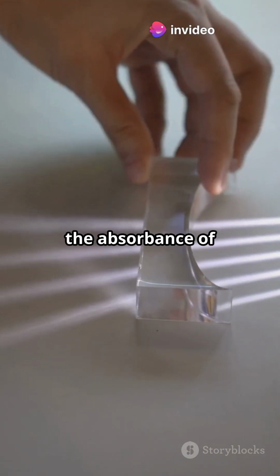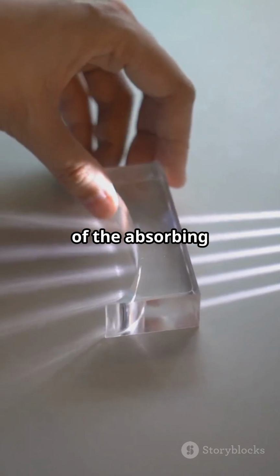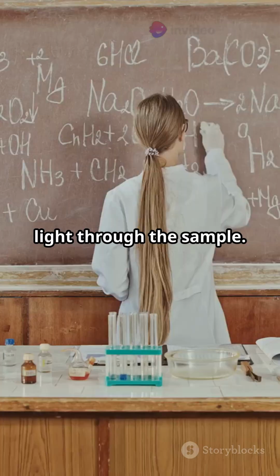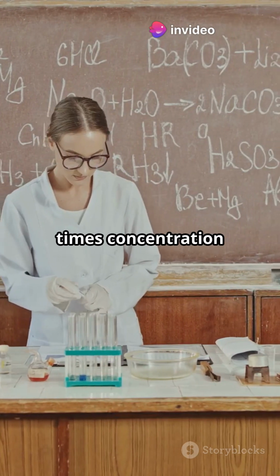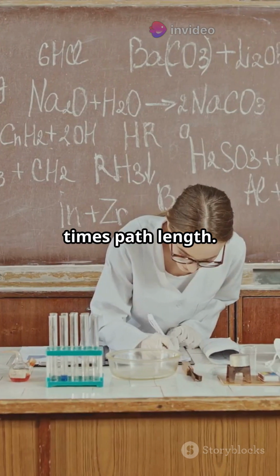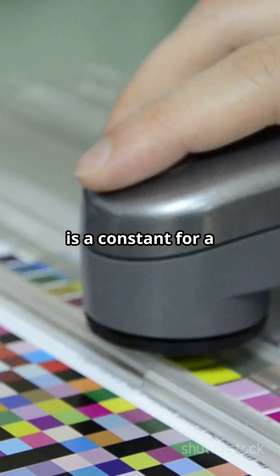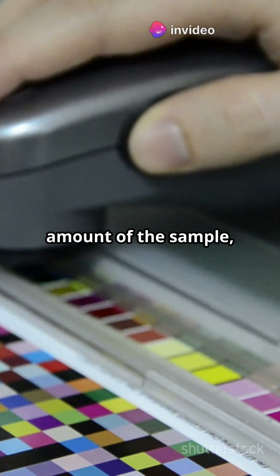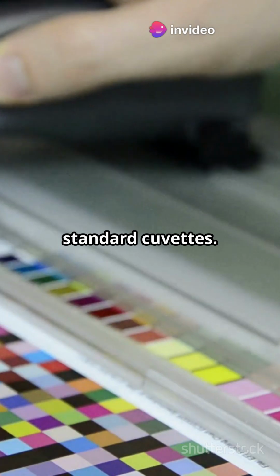This law states that the absorbance of light by a sample is directly proportional to the concentration of the absorbing substance and the path length of the light through the sample. The formula is absorbance equals molar absorptivity times concentration times path length. Where absorbance represents the amount of light absorbed, molar absorptivity is a constant for a substance at a specific wavelength, concentration is the amount of the sample, and path length is usually 1 centimeter in standard cuvettes.